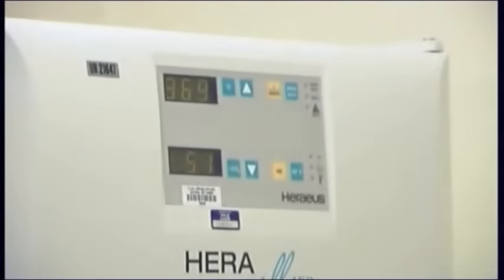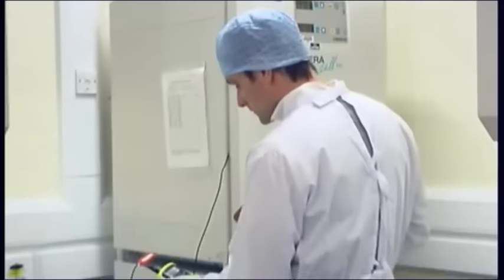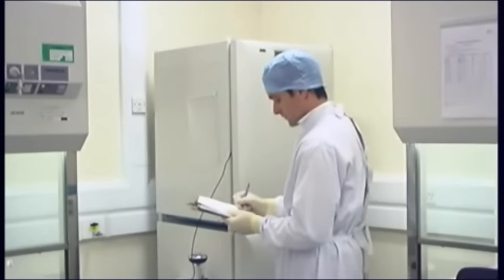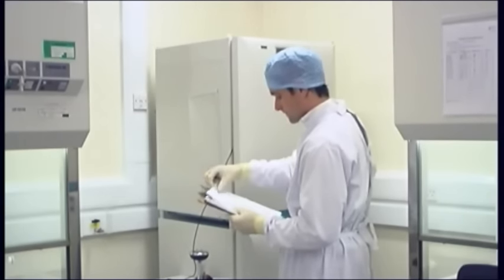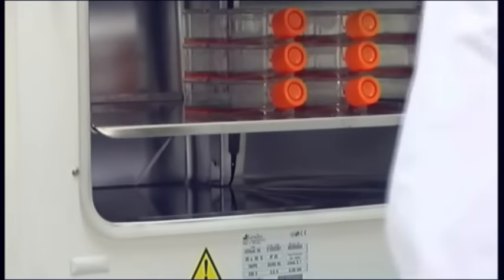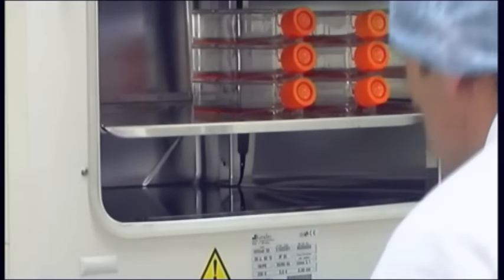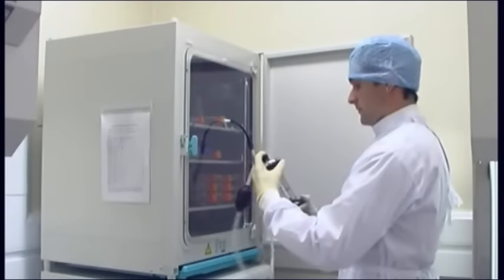Incubators: In vitro cell culture should mimic the in vivo cell environment. Selection of incubator, its features and settings, are dictated by the cell system being studied. 37 degrees centigrade, 95% humidity, and 5% CO2 are required by most mammalian cells and media. More diverse cells may need other incubation conditions. Regularly check and replace water in the reservoir. Independently check the temperature using a calibrated thermometer, and CO2 levels using a ferrite gas analyzer or similar.